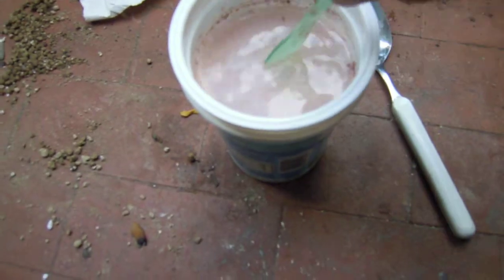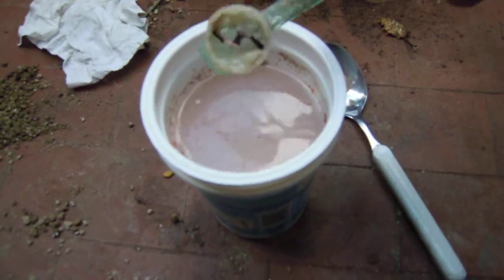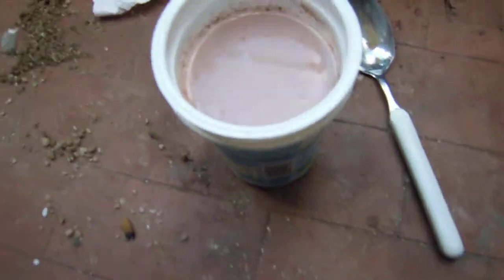As you can see, after a couple of hours we started to break down. We left it in there for other hours — maybe 24, 48 hours. And here we are after six or eight hours: these things have completely melted, as you can see. It does completely melt.